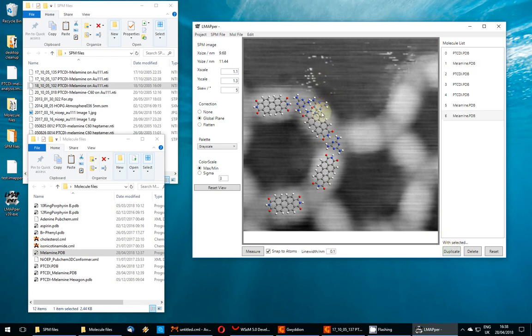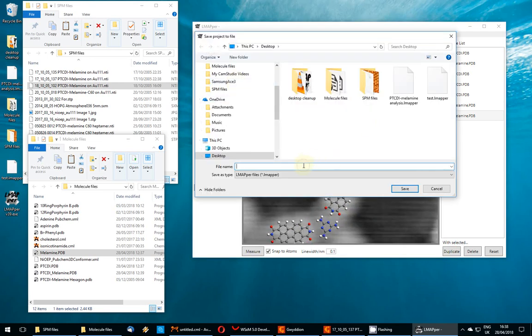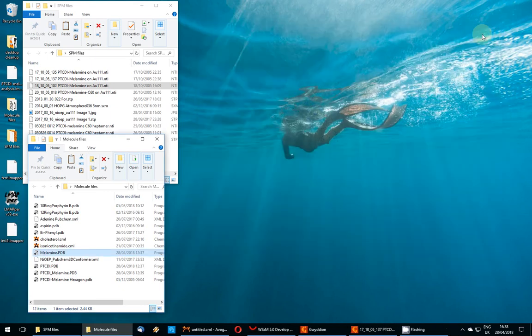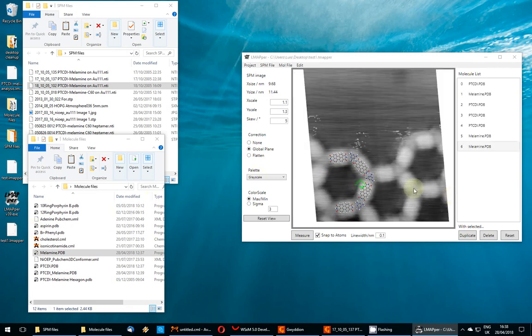There you go. Now, something also useful is that you can save your project. Okay, save. I've got some saved here, but let's call this test 1. That means that if you exit and come back, you can load it. My preferred method over loading images is just to drag and drop, and there you go, everything in the same place.